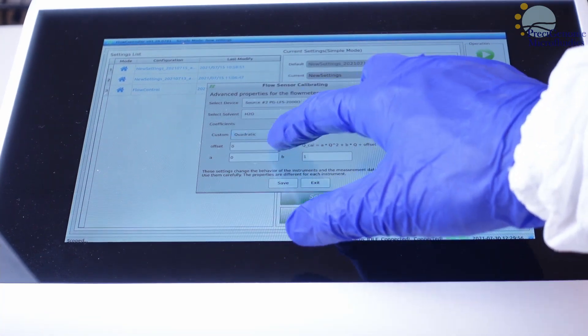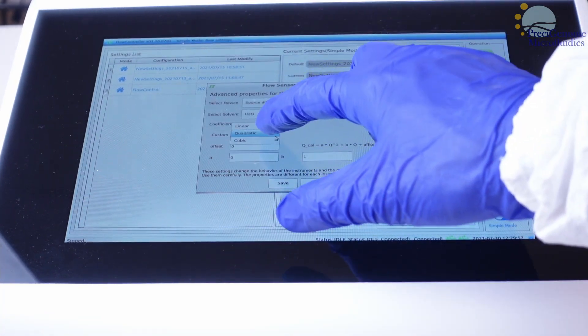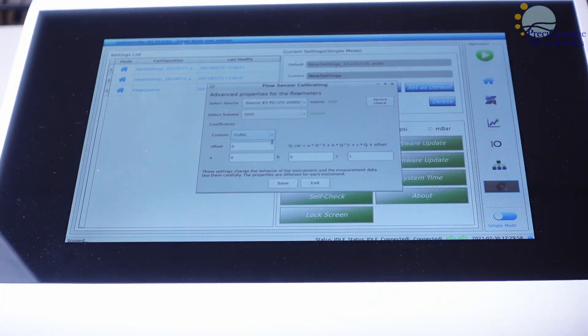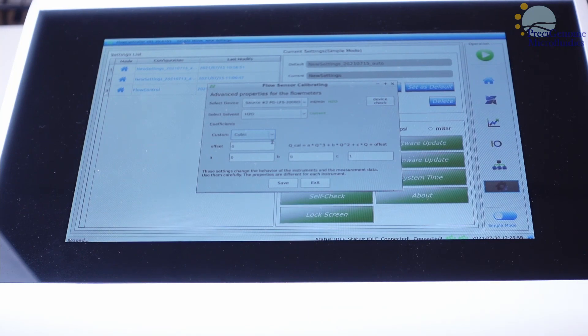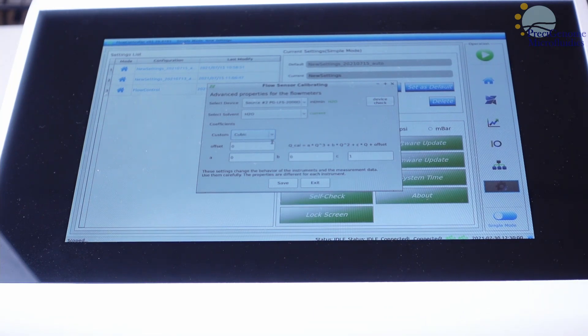Retest your setup after calibration to verify results, and you may proceed with your experiment.